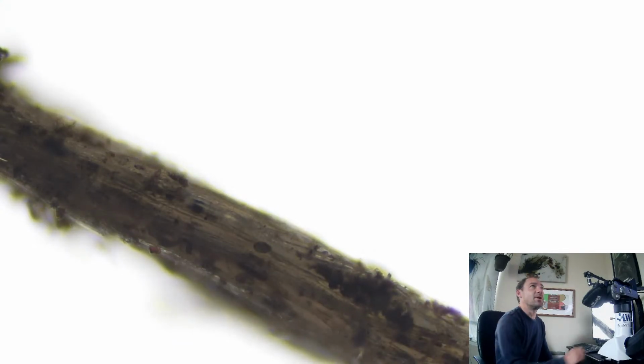That's interesting. Is that a big old spore right in the middle or on top? Let's zoom in on that real quick. But, yeah, if anybody has any last questions before we're just about to call it. Get a really good shot. Probably have to zoom in at 400x or whatever. It could just be an oval aggregate. This stuff over here is just dirt. I was thinking that was the shape of a spore, but hit or miss.